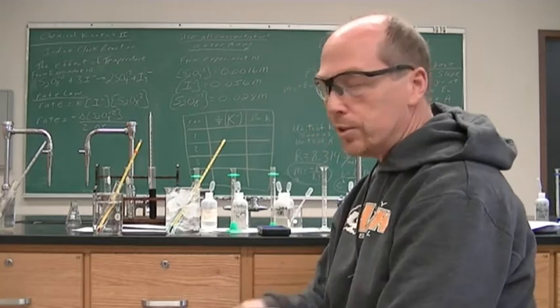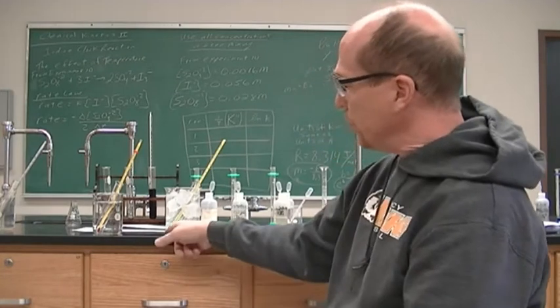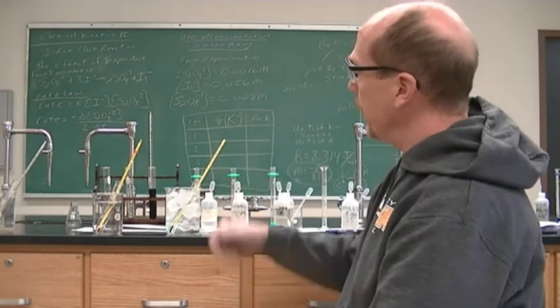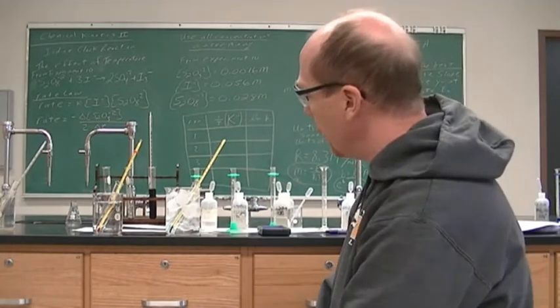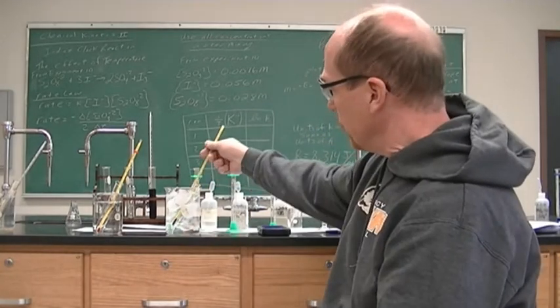And remember, the entire solution has to turn blue, not just the warmest is going to be where it's touching the table or where the air is getting in at the top. So many times you'll see some blue at the bottom or at the top. And having a thermometer that's blue in there is not that helpful for seeing the color.